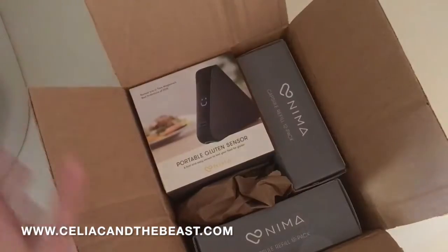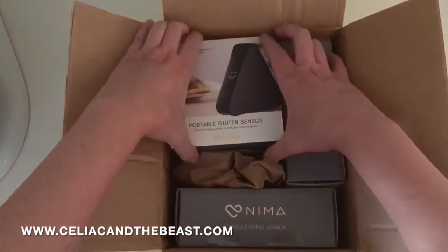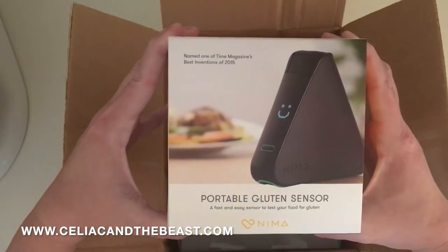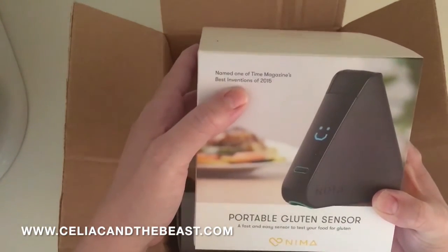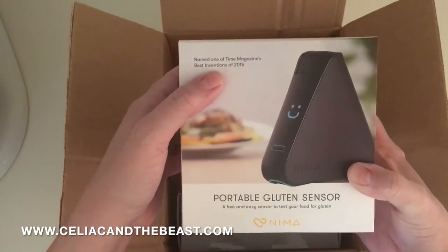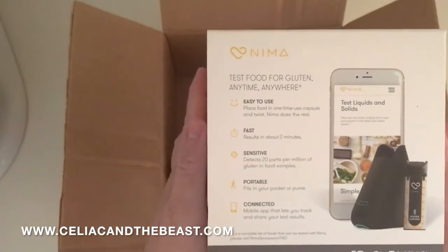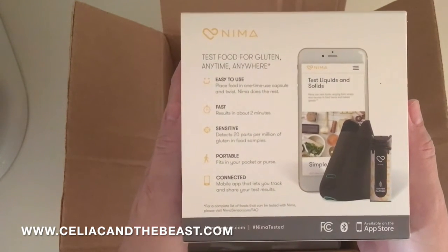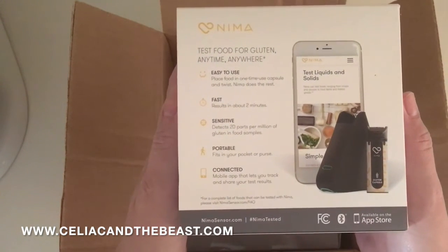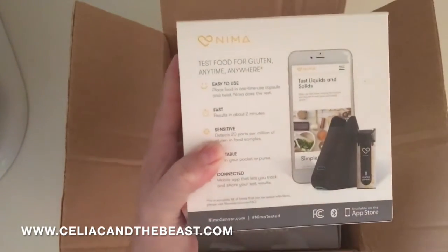Okay you guys, this is the exciting part — look at this! Here's what you'll get for your portable Nima sensor. Look at that, so cute. Oh, Time Magazine's Best Inventions of 2015 — good for us! Here is what the box looks like: 'Bringing peace of mind to meal time.' On the back it says: test food for gluten anytime, anywhere — easy to use, fast, sensitive, portable, and connected. I can't wait to get the app and let's remember to use hashtag Nima tested on anything that we test.